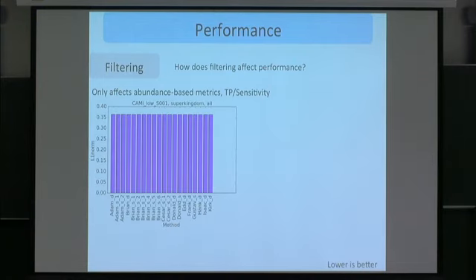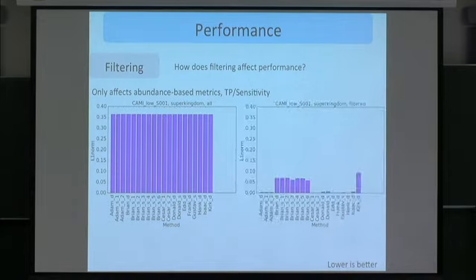Yeah, so where you can see this is, for instance, at the superkingdom level. So here is the CAMI low sample, including the circular elements in the ground truth. L1 norm, every method does uniformly bad. However, when you filter it, then the L1 norm, this is lower is better, everybody uniformly improves.